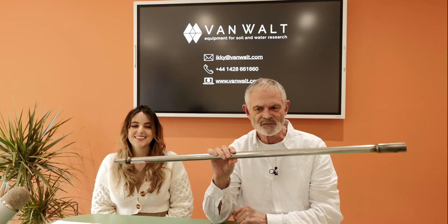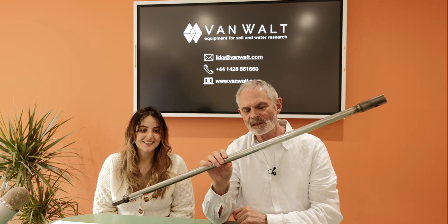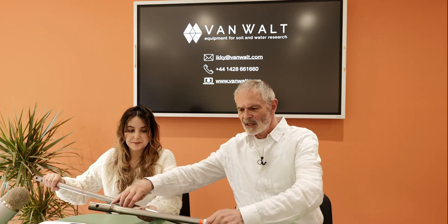Incidentally, these are made of stainless steel, so very easy to clean, and also because they're standard lengths, 50 centimeters and a meter, it's very straightforward to determine to what depth you might be working. So if I can just pass those on, and maybe also the quick pin.